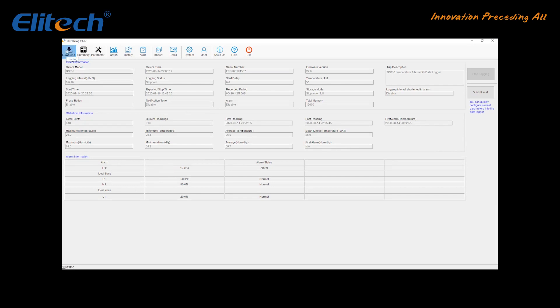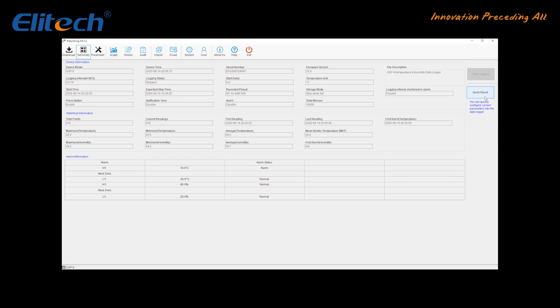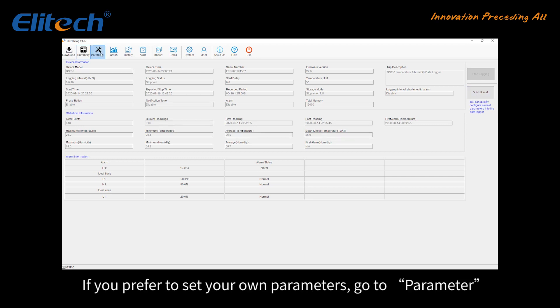Click the Download button and the report will be generated. If you use the default parameters, go to the Summary page and click Quick Reset to synchronize local time before usage.